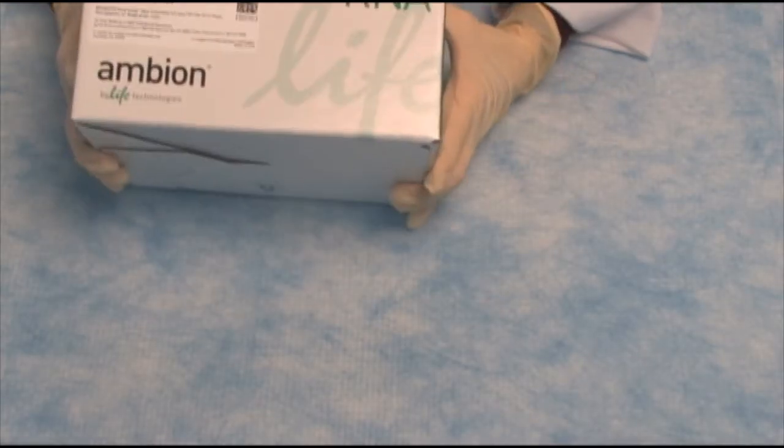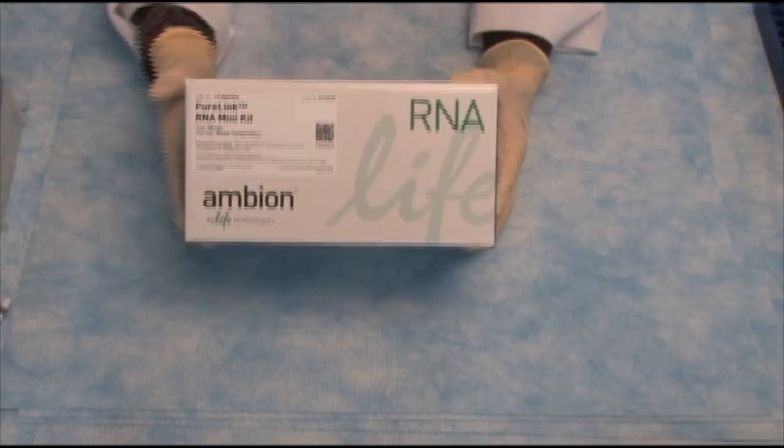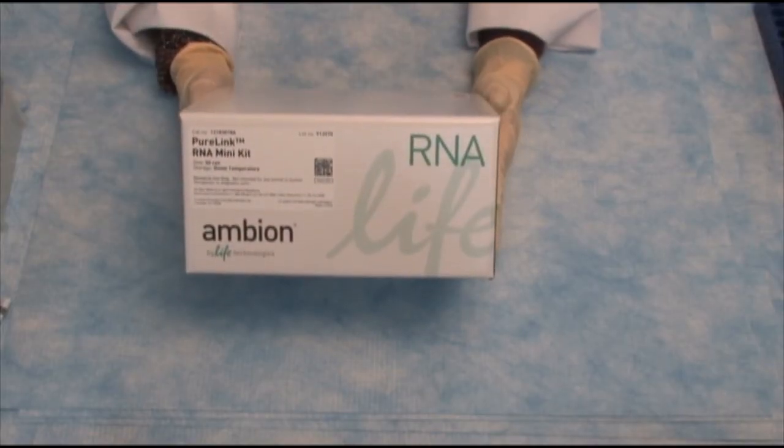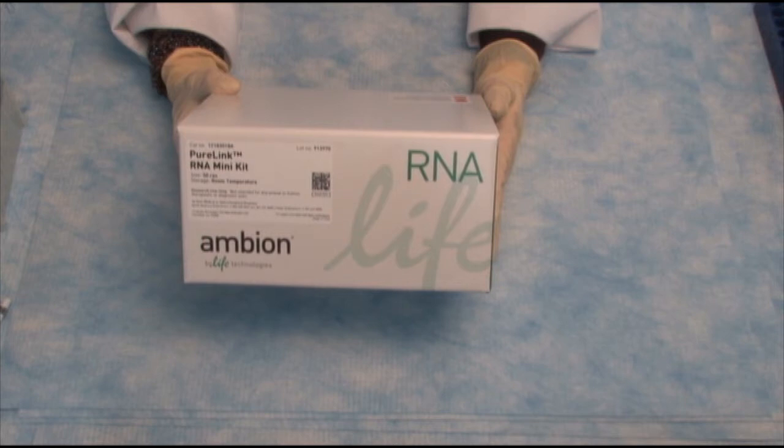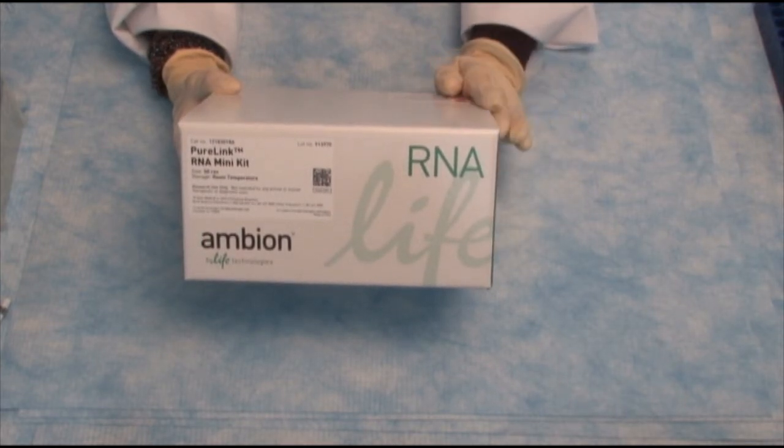Let's unbox our qPCR workflow, starting with preparing the sample. The kit we'll be using today is called the PureLink RNA Mini Kit. PureLink RNA Mini Kit is a fantastic kit to purify RNA from cells or tissues. It's a very easy-to-use kit and a very quick kit.